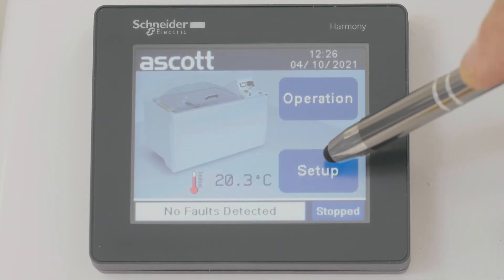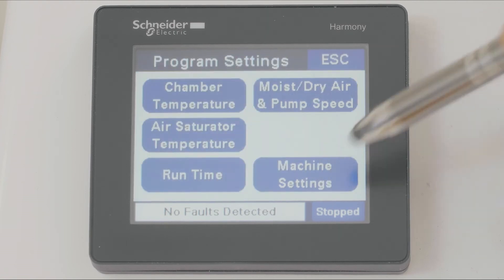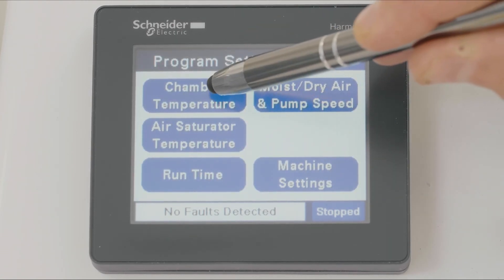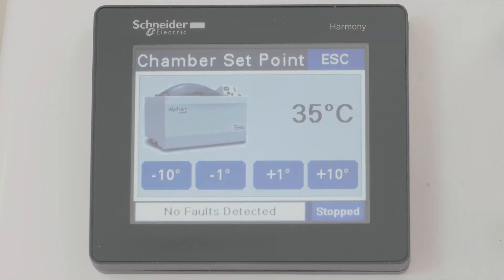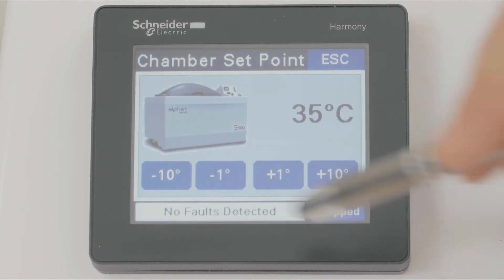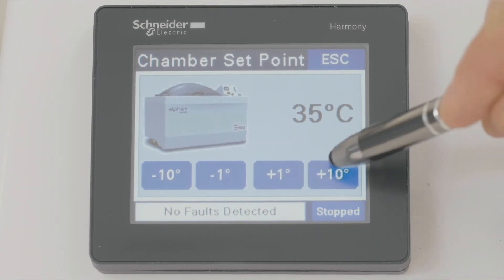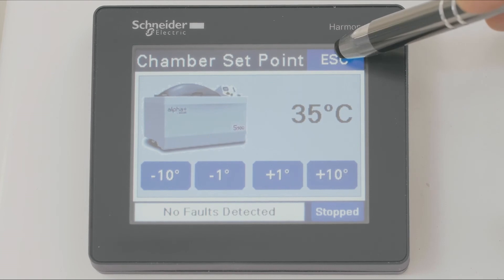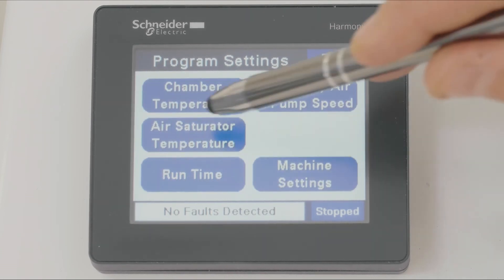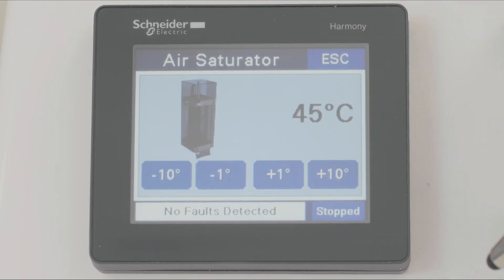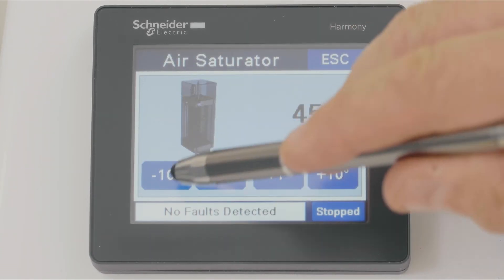Back to the home screen. If we press setup, we can now alter the chamber set value for temperature, using the increase and decrease buttons, either 1 degree or 10 degrees. We can change the air saturator temperature in the same manner.